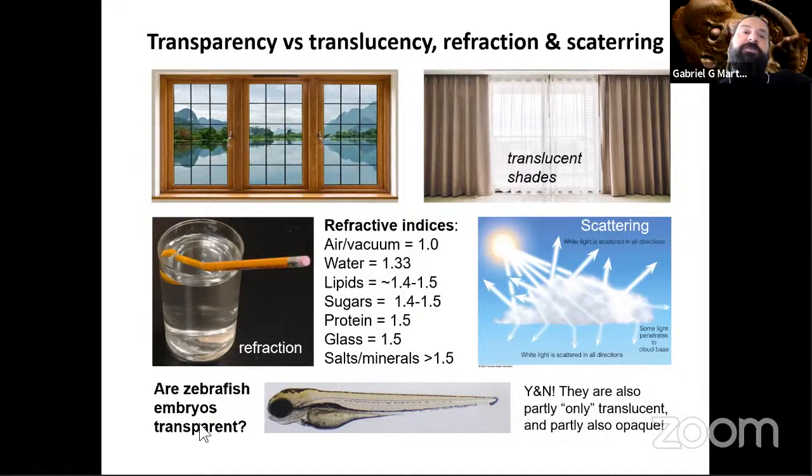So some of you may have heard this idea that zebrafish are transparent and they're very good for studying in the microscope because they're transparent. This is commonly said, but it's not 100% accurate. In fact, parts of a zebrafish are transparent enough that you can image with detail. In this case, for example, the internal ear details can actually be seen from the outside. But a lot of it is actually translucent as well, this part where you have lots of organs. It's extremely difficult here to get a lot of detail because there are so many different tissues and so many different characteristics that it becomes difficult to maintain the light properties consistent and get details.